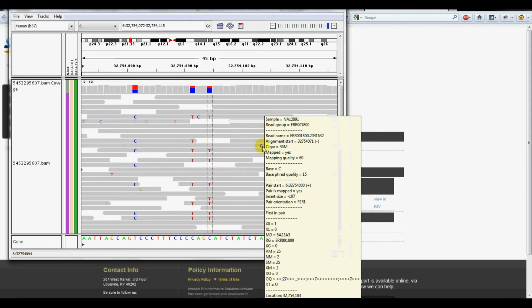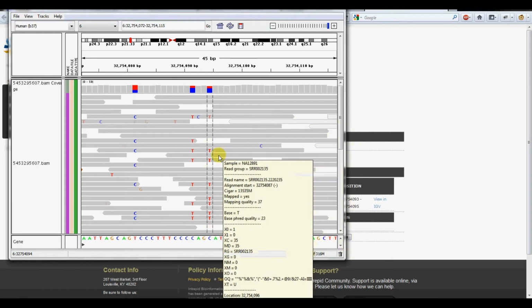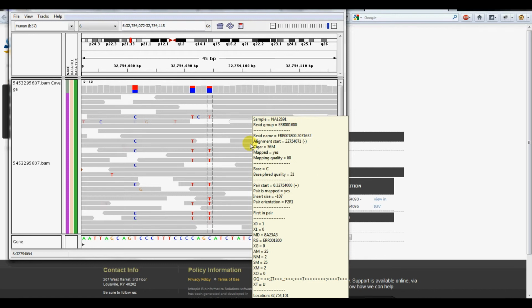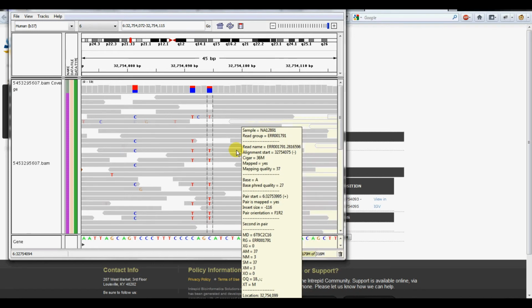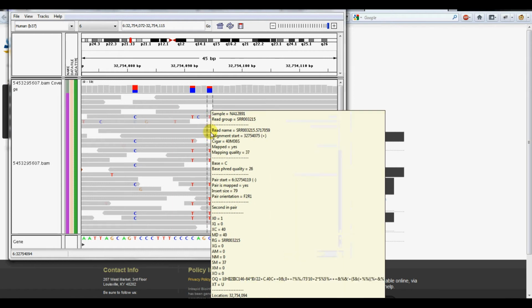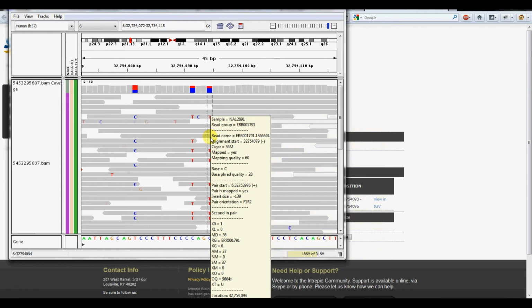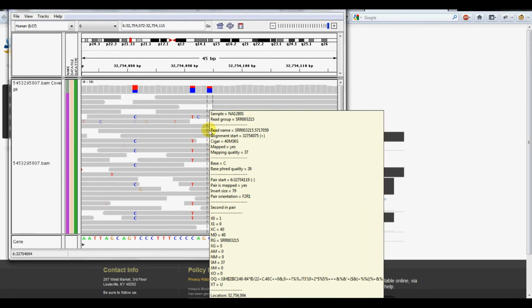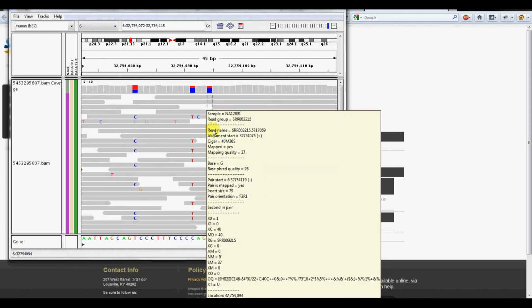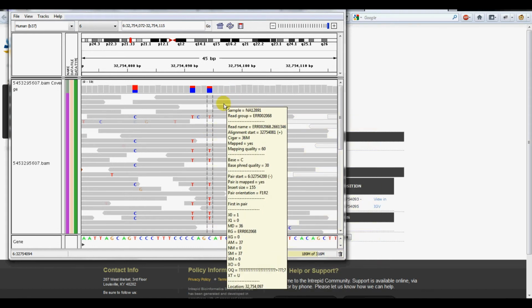And if the assay was designed against that region of the chromosome, then clearly it is not going to be able to anneal to that locus in order to pull down that T allele, and thus the only allele that would be visible for this individual would be the C allele, which is on a chromosome that is consistent with the oligonucleotide that would have been designed to assay it.